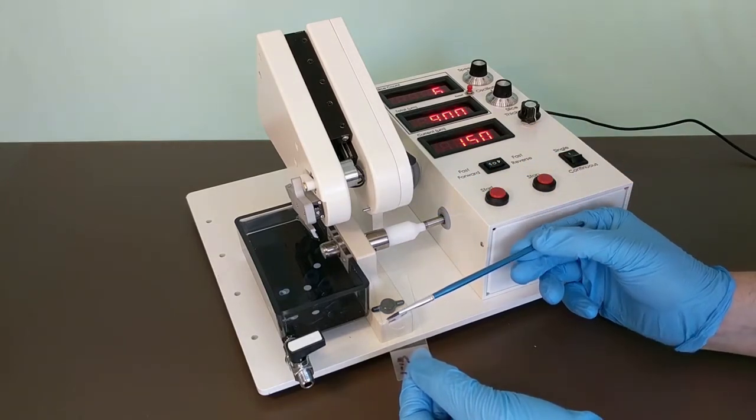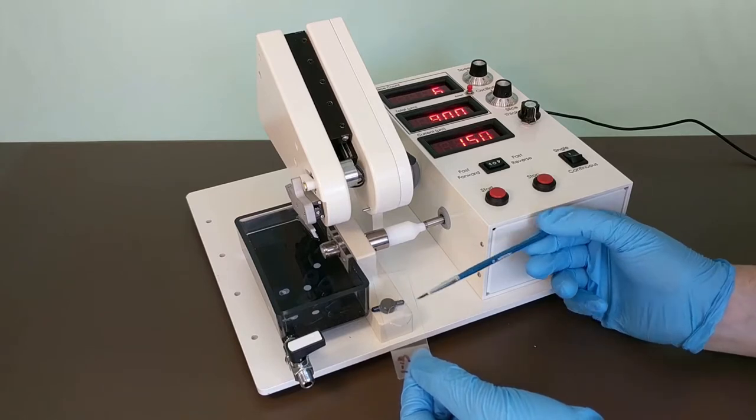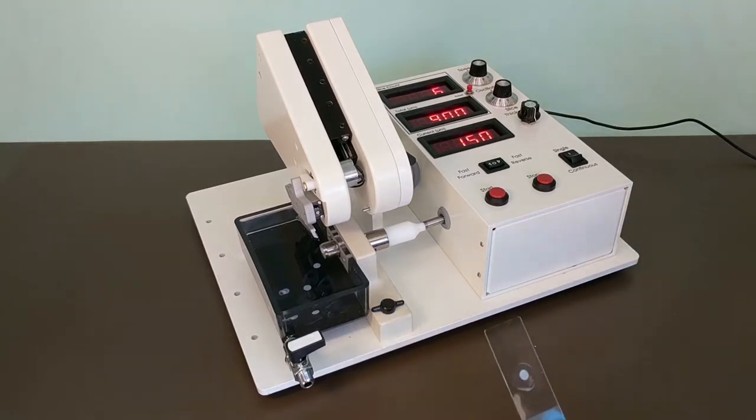Alternatively, you can use a third party plating tray and transfer your slices using a disposable transfer pipette.